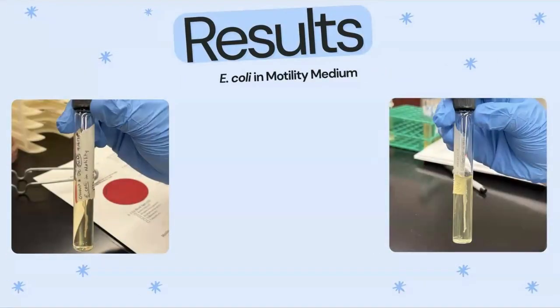When we look at the motility mediums now with the E. coli, it was very interesting to see this type of growth. It was extremely linear and it was very visible. And so it was quite a successful type of growth that was seen, and we were able to capture it effectively through the photo.